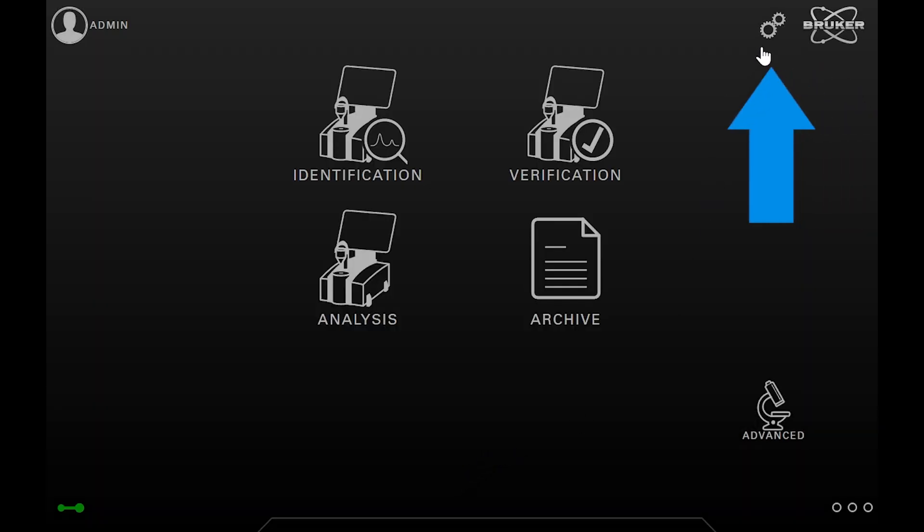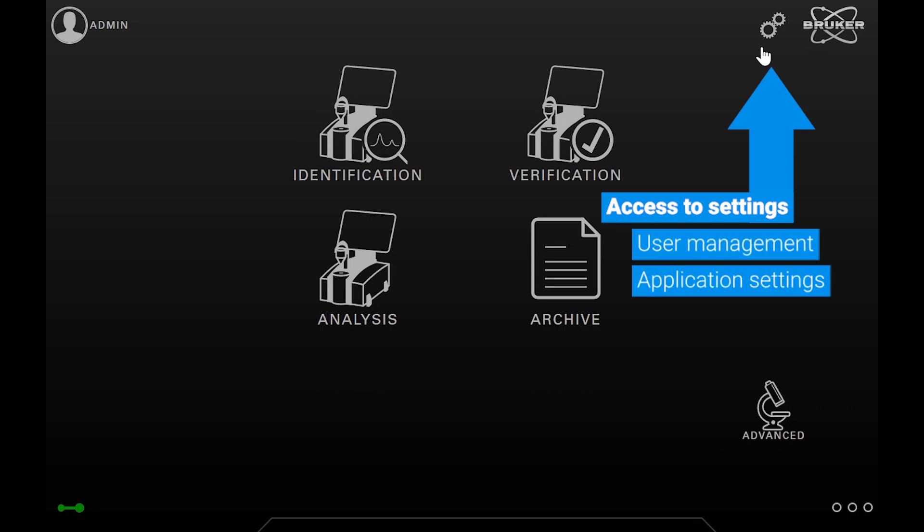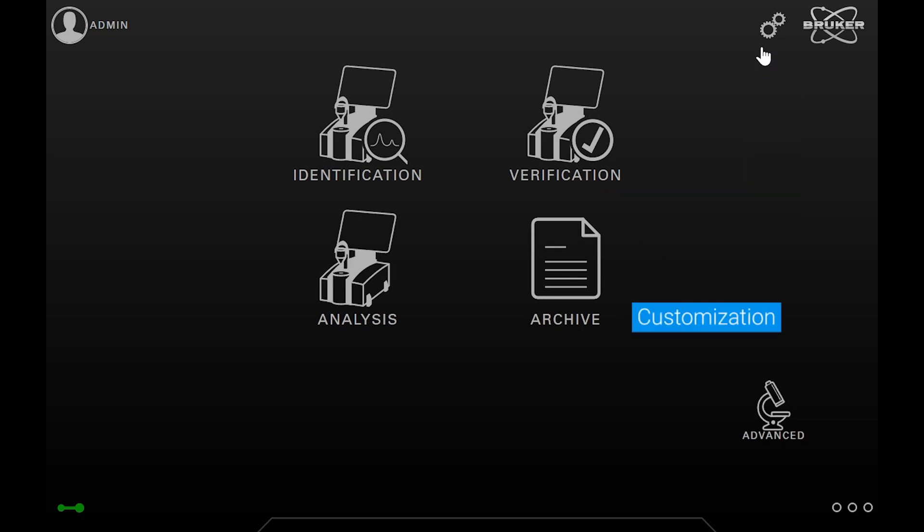Directly to the left, you can see the settings icon with two gear wheels. It allows you to see and configure all kinds of settings such as user management, application settings, customizations, and so on. More on the settings will be shown in an extra video.